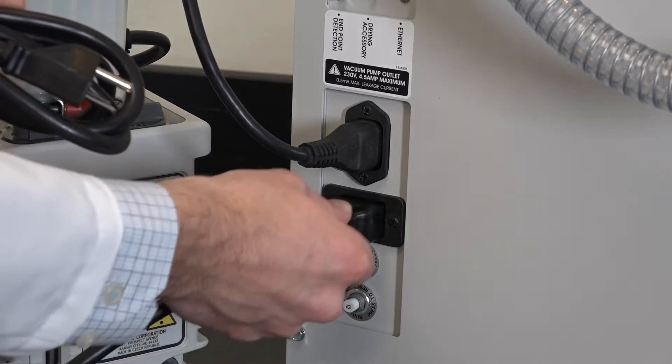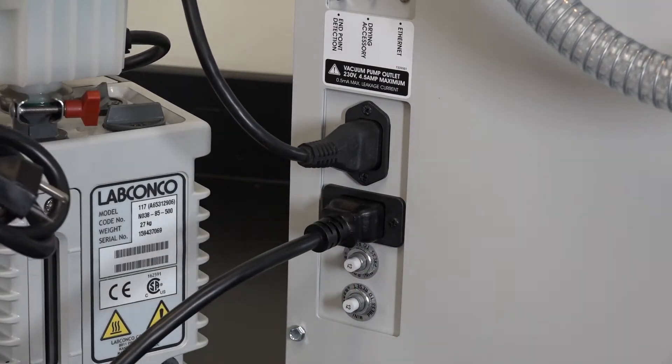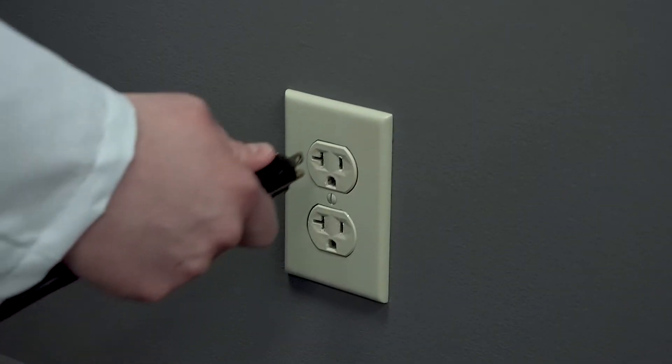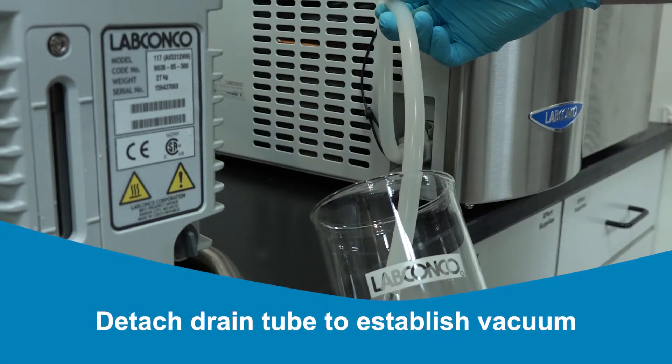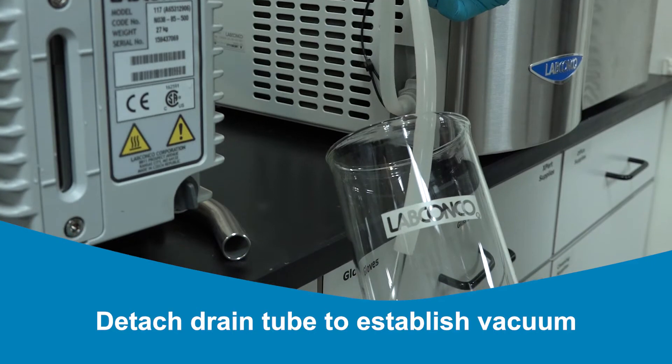Install the power cord into the receptacle on the back of your Freezone and plug the other end of the cord into the electrical wall outlet. The drain fitting should only be inserted when draining the collector, not during lyophilization.